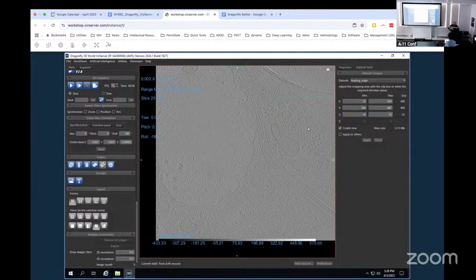All right. You can click and drag on that middle handle of the box now and drag it to wherever you want it to be. I would drag it somewhere like here. This is where you, as a human, have to figure out what you want. We're going to look at microtubules.